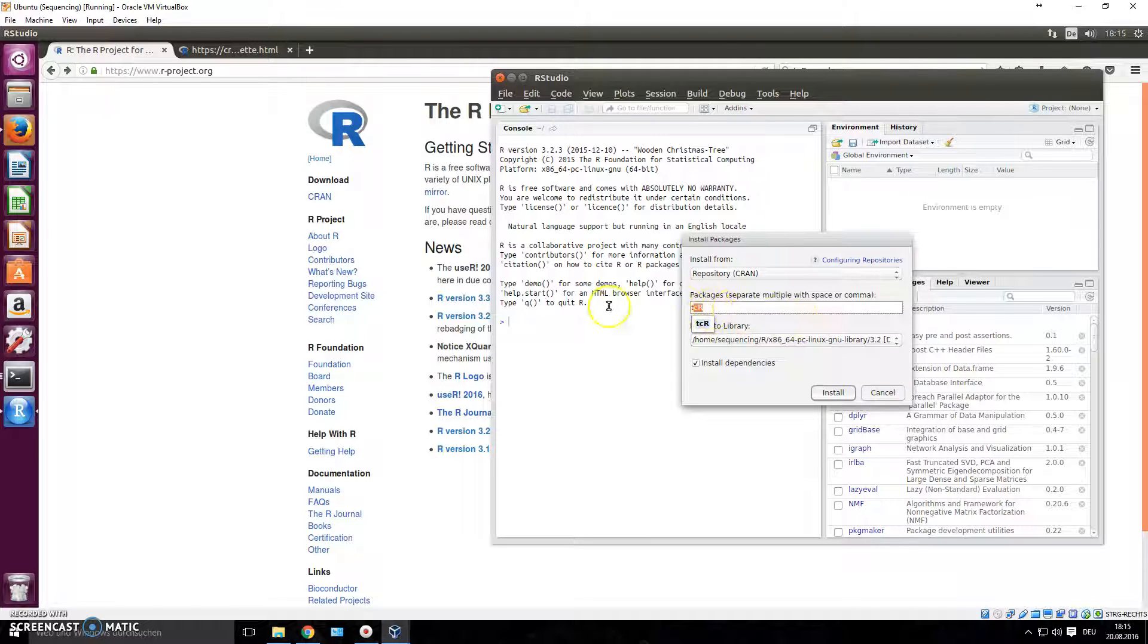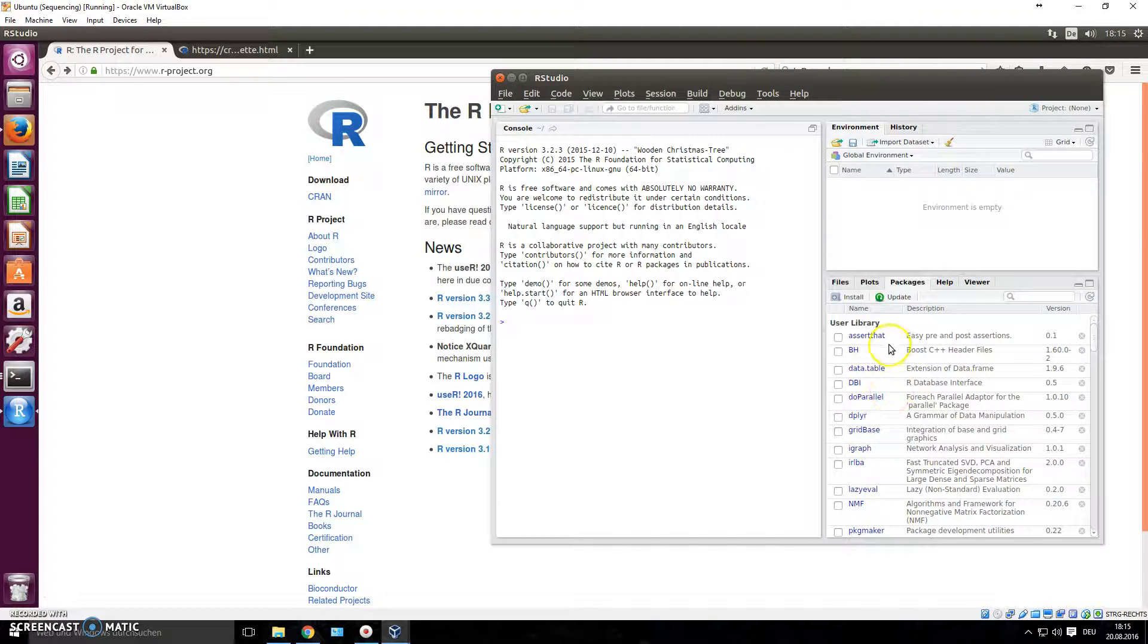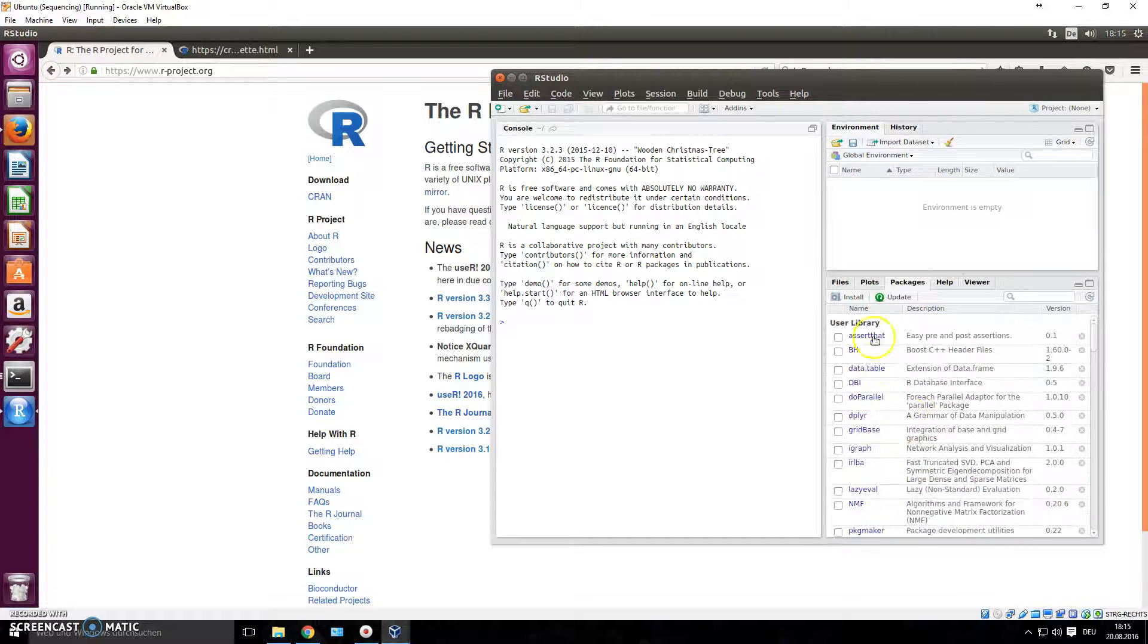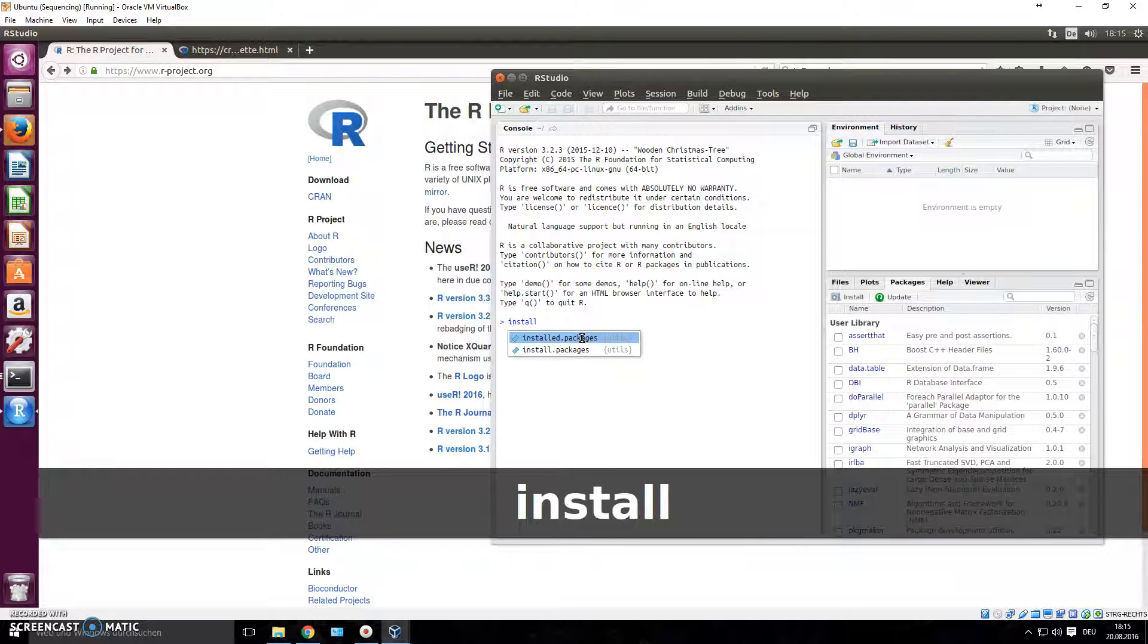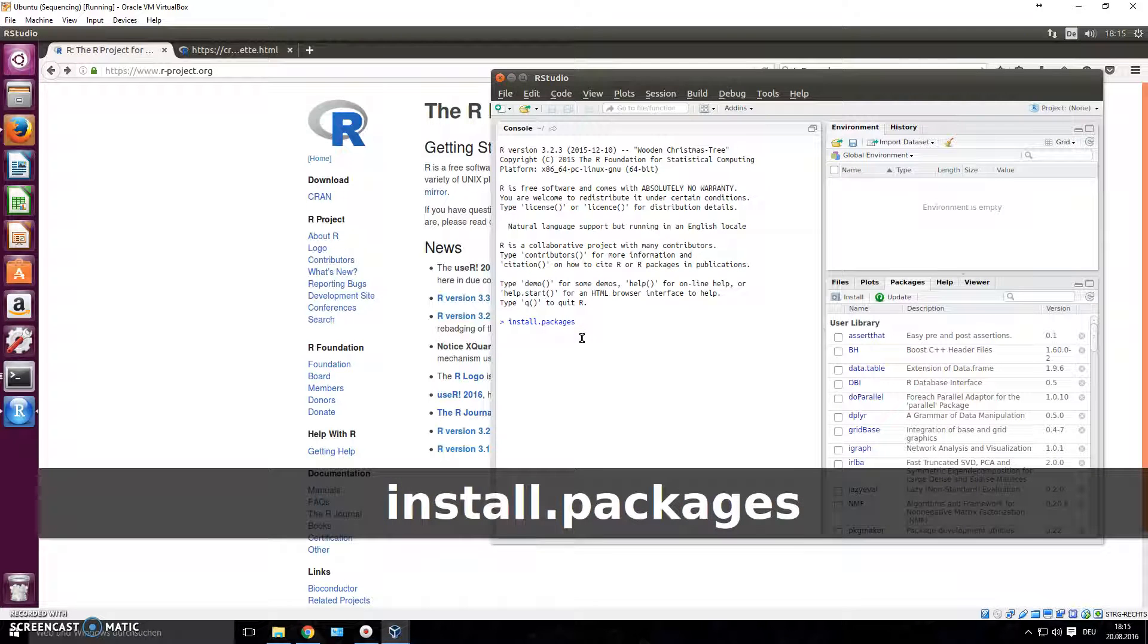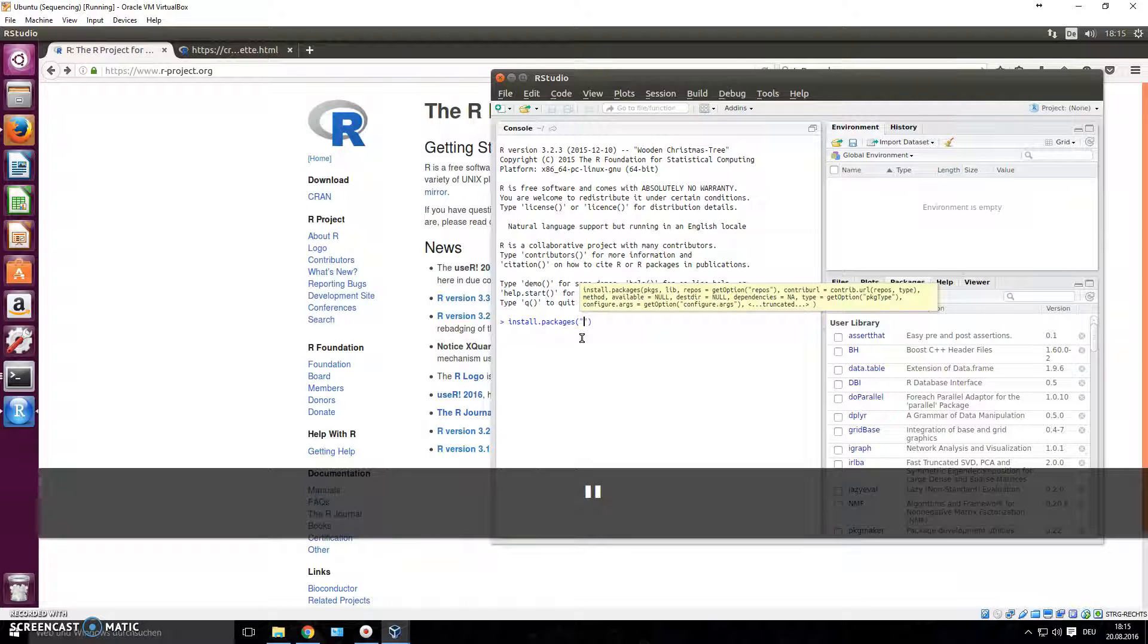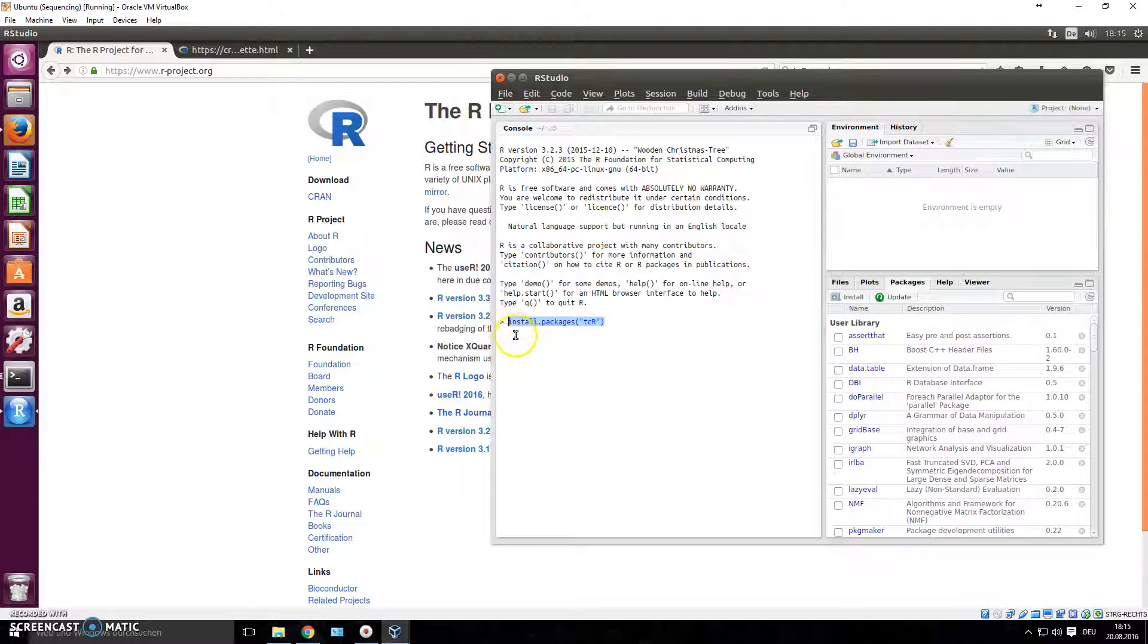For some people this doesn't work, they click install but it still doesn't work and they won't have the package in their library. If that doesn't work you can also do it manually by typing install.packages, open brackets, close brackets, then in quotation marks you write the same thing: tcR with capital R. You press enter and it should install the whole package and all dependencies, everything else it needs for the package to run.